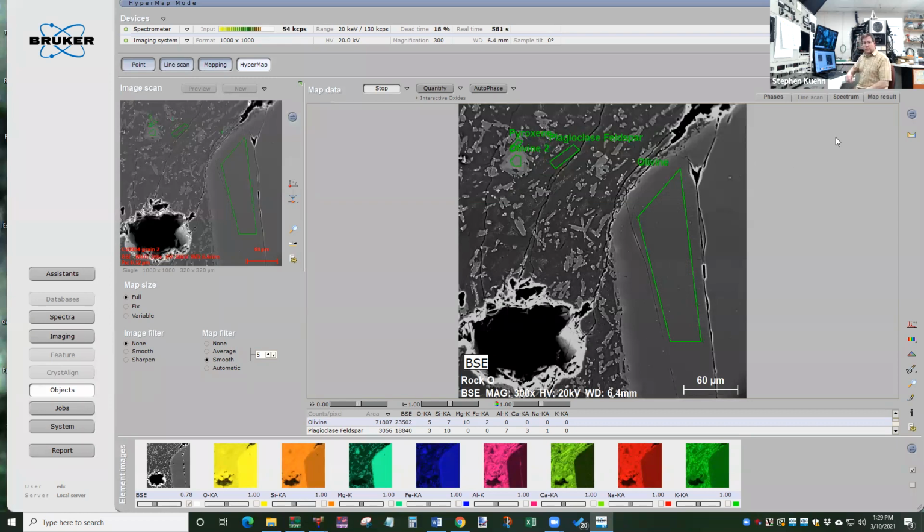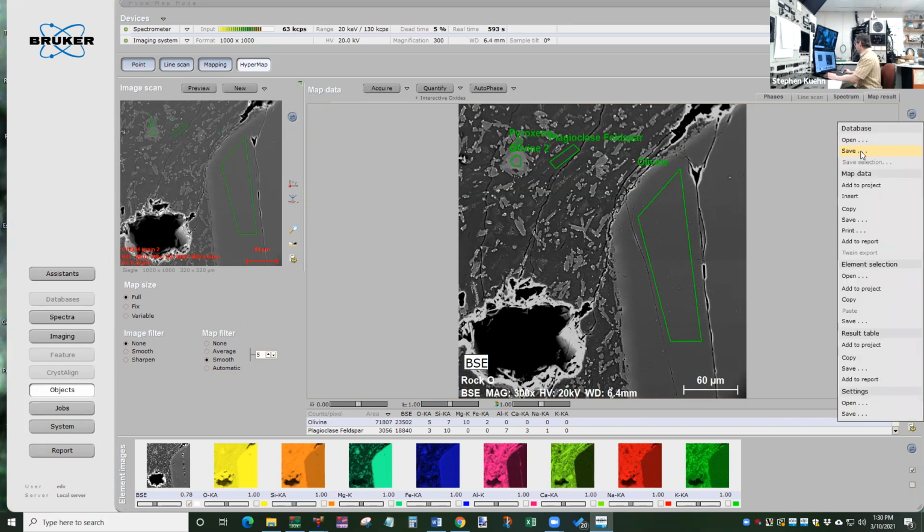So on Friday, we'll put those things together, the dark color, the minerals, the texture, and we'll add in what kind of rock it is. So I'll leave you in suspense until Friday, but you can probably guess what it is. All right, so I'm going to save this.